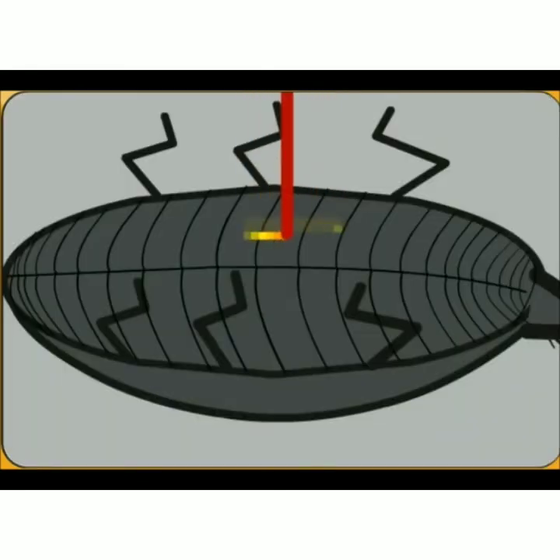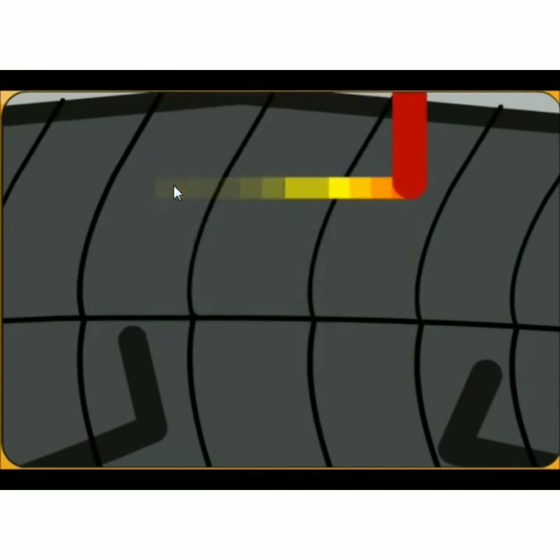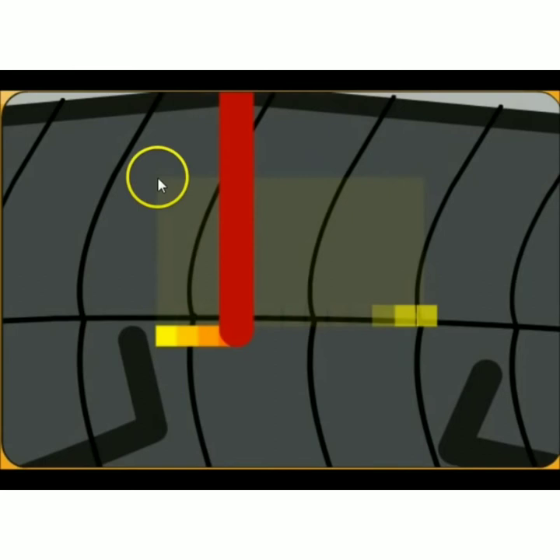So why is it called a scanning electron microscope? Well, as you can see from this illustration, here's our primary beam coming down, and it's actually making the picture pixel by pixel. It's hitting from left to right, top to bottom, and every time it hits, we get electrons from that particular part of the specimen. Interestingly enough, if you want to magnify, instead of scanning across a big image like this, we just scan over a smaller box.